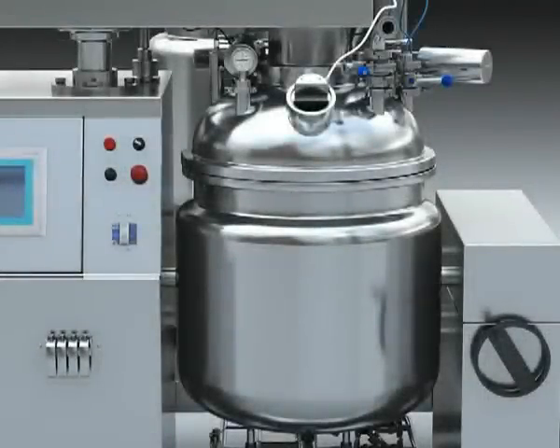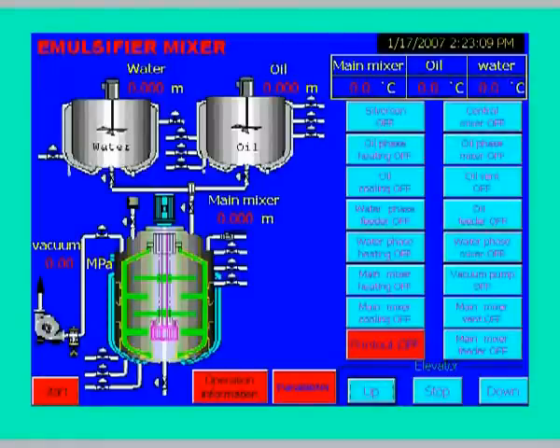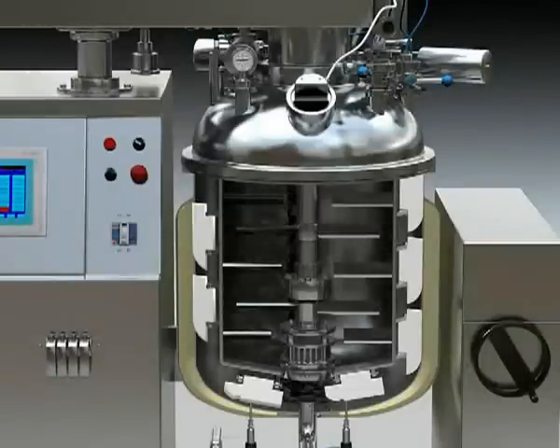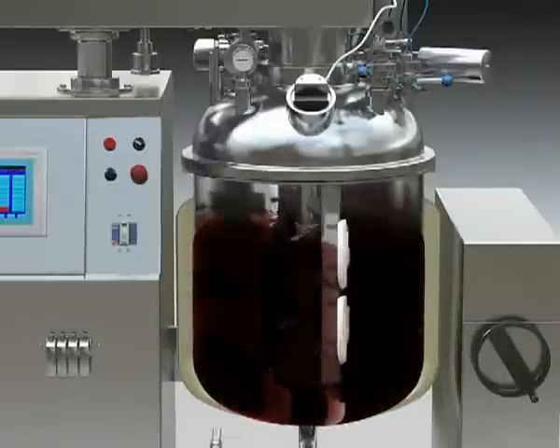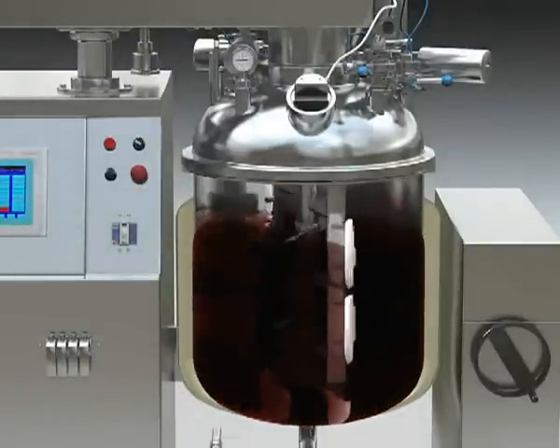3. Material feeding to main tank. Check if the material after being dissolved meets the requirement of the batch process, and then touch the vacuum pump on the touch screen. 4. When the vacuum degree reaches minus 0.06 MPa, open the feeding valve of the main tank and the valve at the bottom of the oil or water tank, and the material will be fed to the main tank under the negative pressure of the vacuum. 5. Close the feeding valve of the main tank and the valve at the bottom of the oil tank or water tank, then touch the vacuum pump off button on the touch screen.